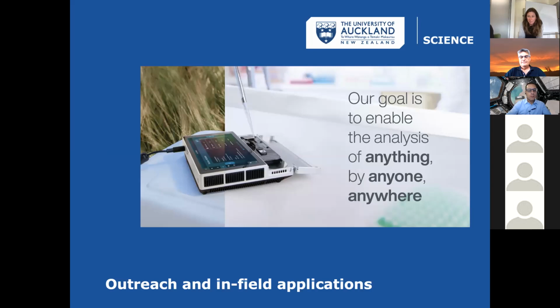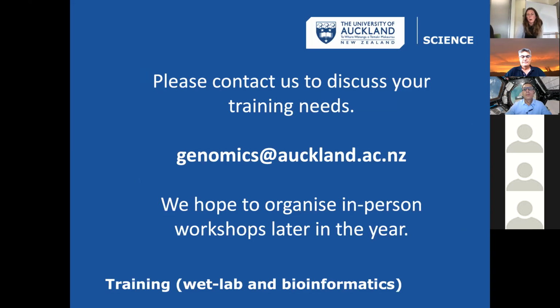It's also a really, really good tool for outreach. One of the things you can do is take it into schools, or out to community groups. It's really neat in an environmental DNA setting, for example. So it's one thing to bear in mind, and we can support you in doing that. And taking it out into the field is sometimes a really useful feature.